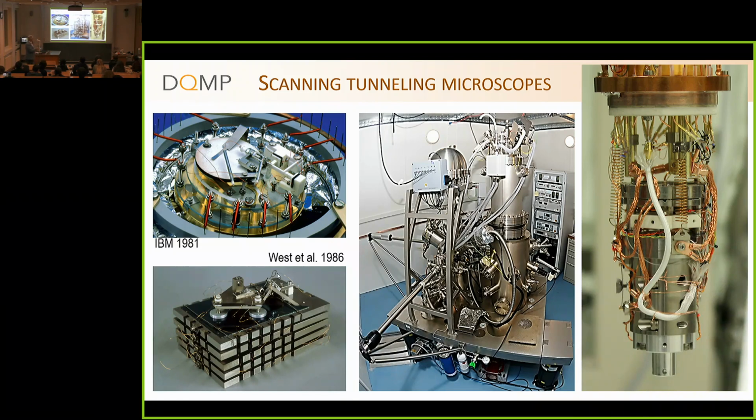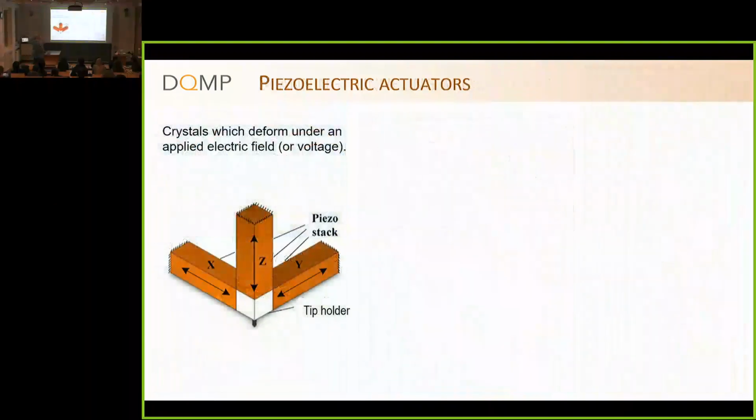Today we have vacuum chambers, in situ manipulators, and full XYZ positioning of the tip and sample, and you end up with quite a complicated environment because you want ultra-high vacuum and you want to be able to reach very low temperature and possibly magnetic field. This is an example of the head. This is what comes inside, not of this system, but some other one. This would be the head where you have some additional vibration damping systems in situ. So these are quite sophisticated instruments.